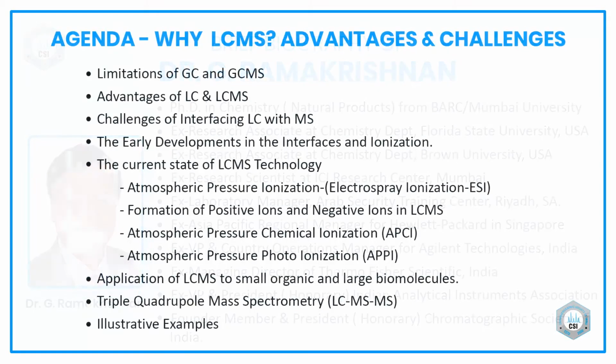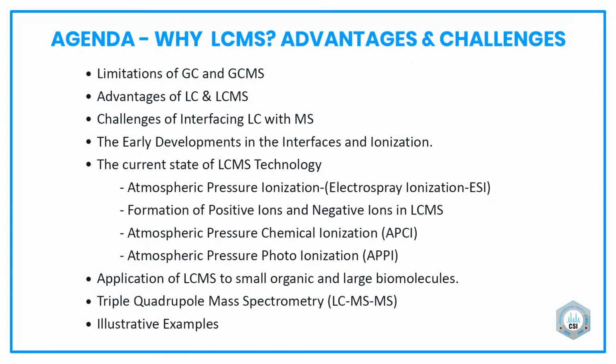I want to stress upon the fact that a mass spectrometer is not a separation technique. It is an identification technique. So the better your HPLC method is, the better results you will get on LCMS. So that is very, very important.